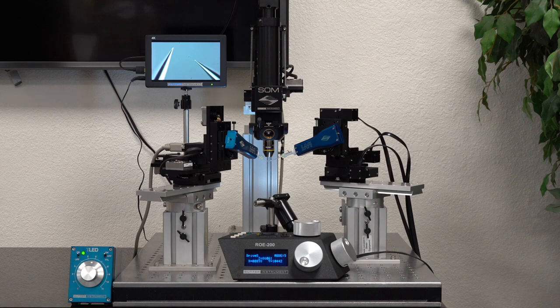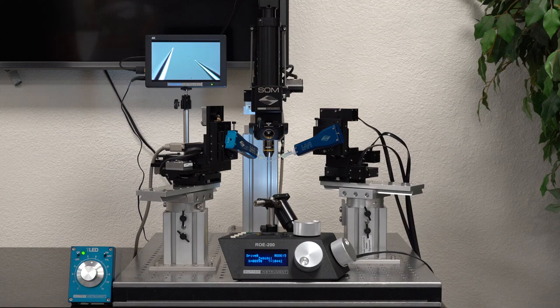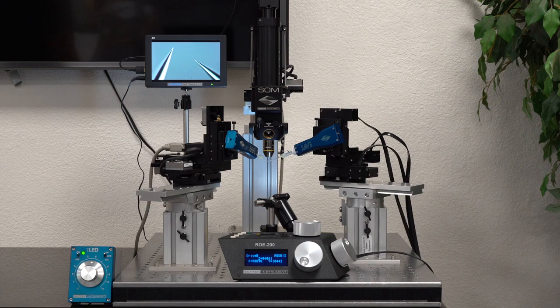For the rig they wanted to build, they did not need the expensive two-photon imaging-related parts of the MOM design. We designed them a small, simple microscope which is mounted on a standard MP285 manipulator to provide motorized objective positioning with the included MPC200 controller.